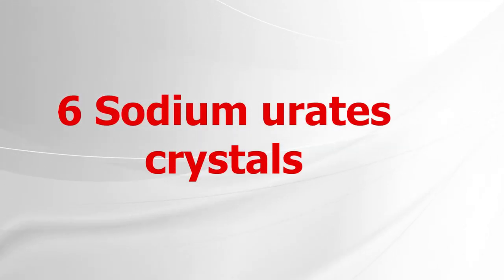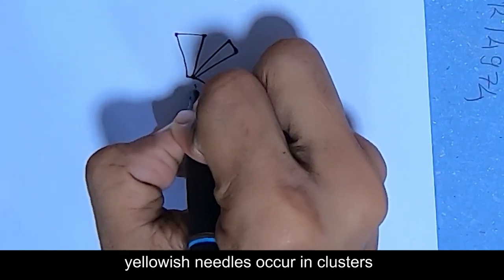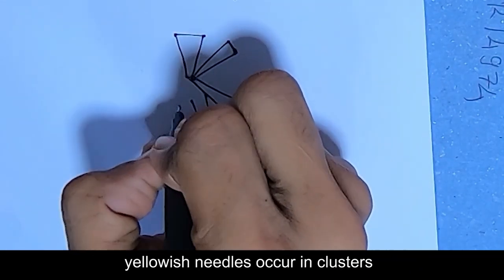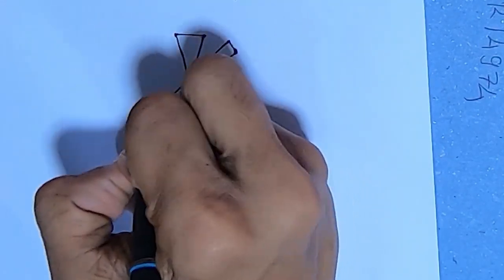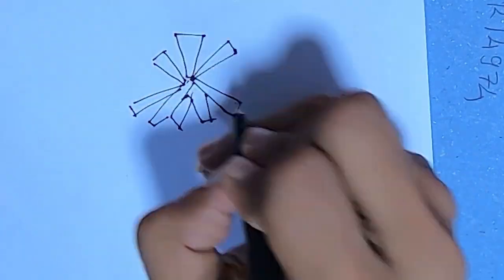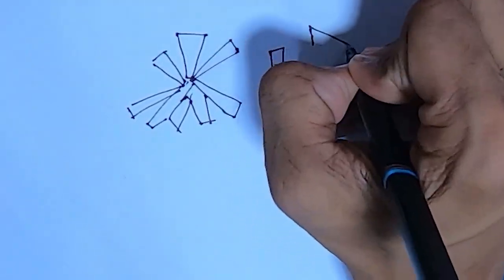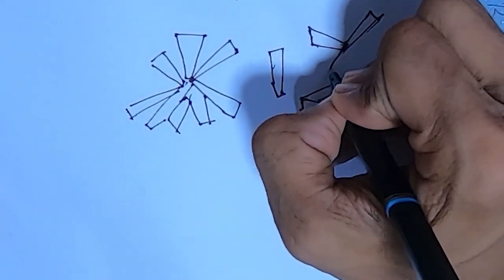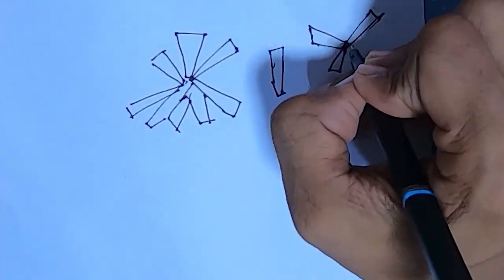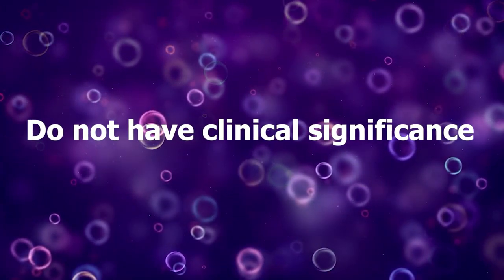Sodium urate crystals. These are yellowish needles that occur in clusters and they are soluble at 60 degrees Celsius. They do not have clinical significance.